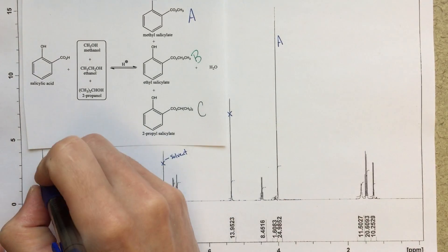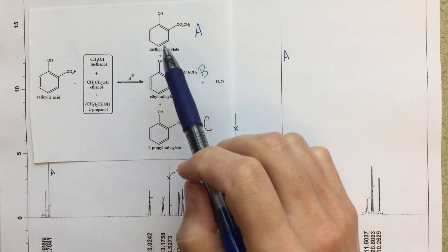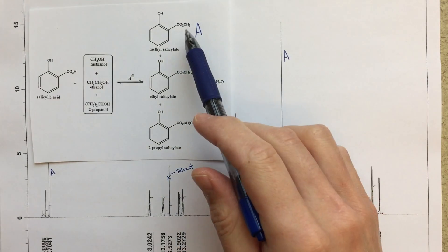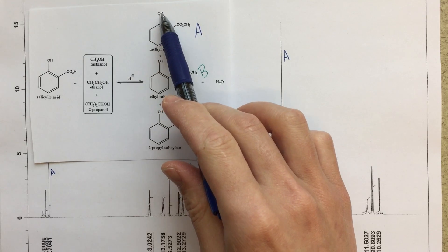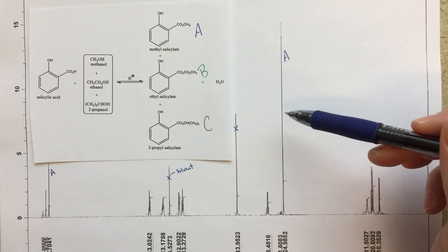So right away, I'm sort of thinking to myself, well, this integrates to three, and one of these should integrate to one versus this integration of three. So I think that, right away, I can say that this tall peak here, that's also going to be for this methyl product, because I've got my methyl group here, should integrate three to one.